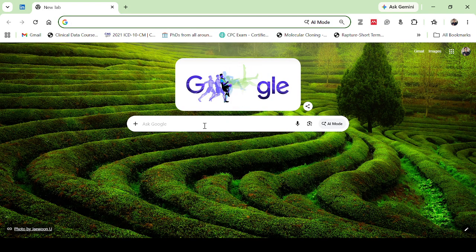Now, the SRA contains datasets from a wide range of studies, including whole genome sequencing, RNA sequencing, metagenomics, single cell sequencing, transcriptomics, epigenomics, and microbiome studies. Because the data are raw, researchers can analyze them using different pipelines. The SRA is widely used because it allows scientists to reuse publicly available sequencing data without having to generate expensive new datasets.